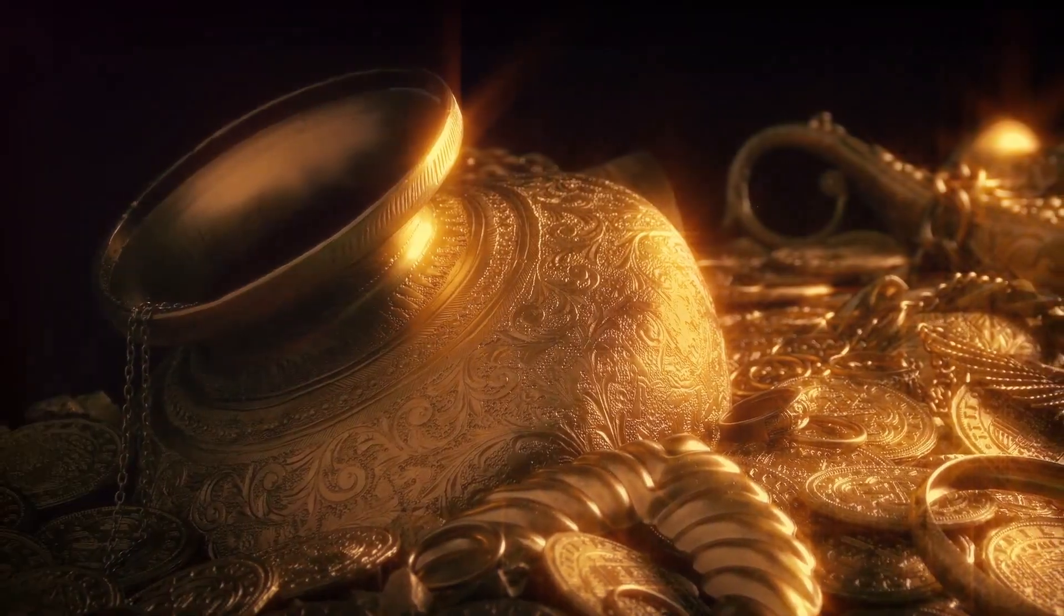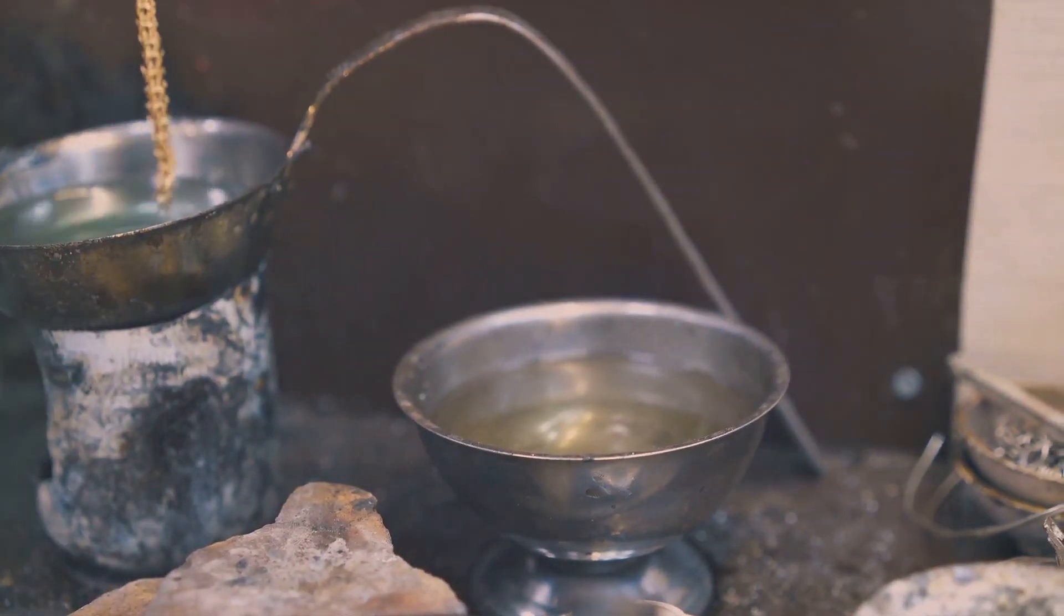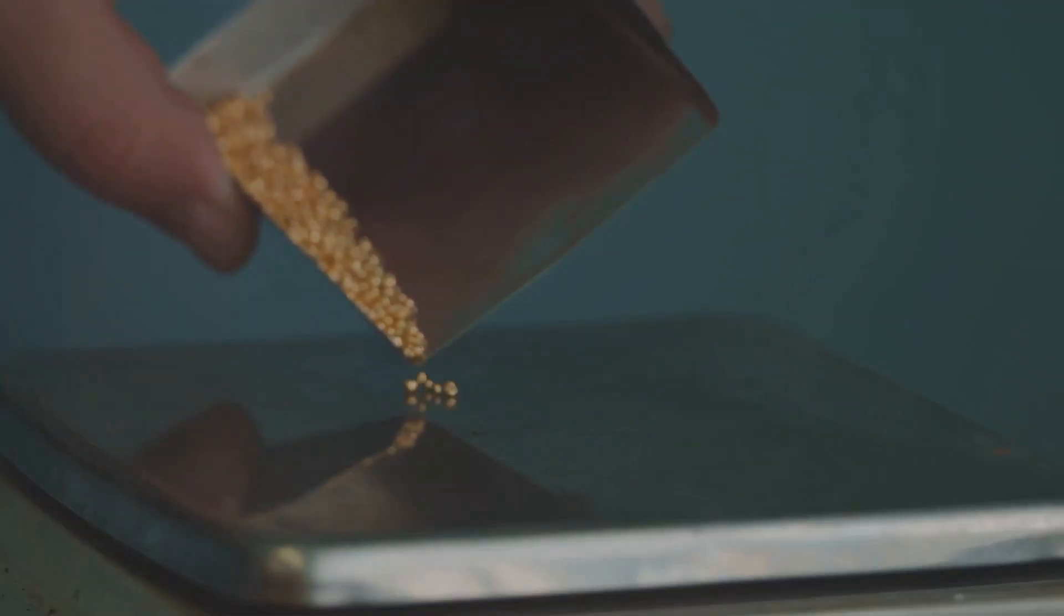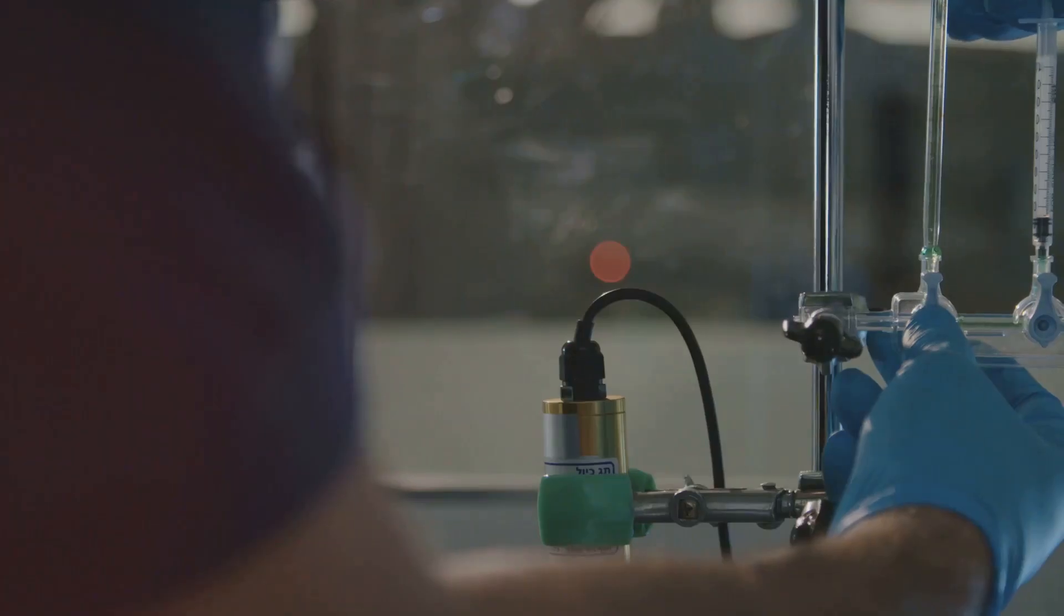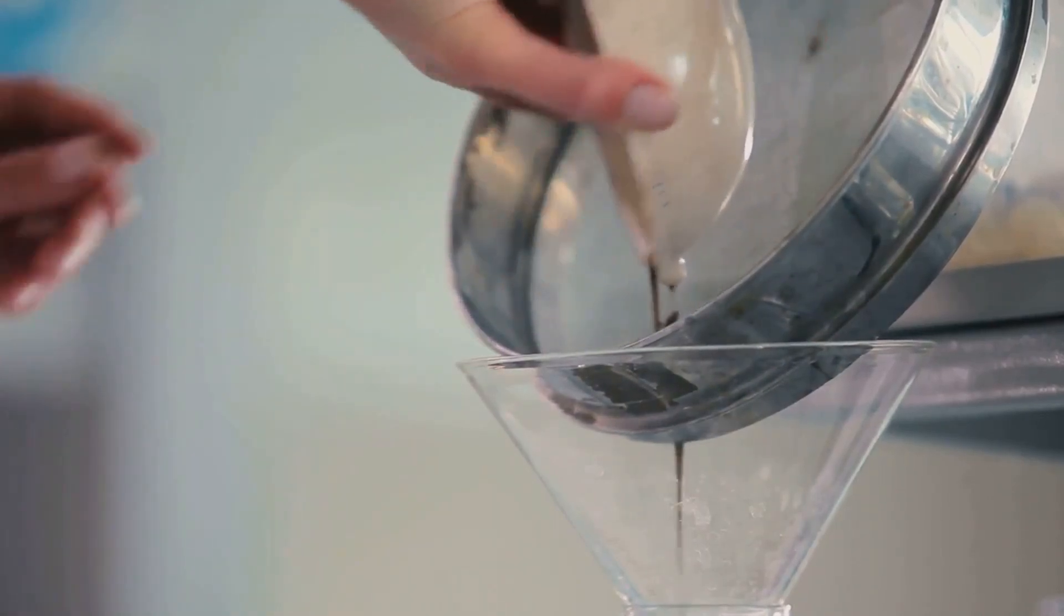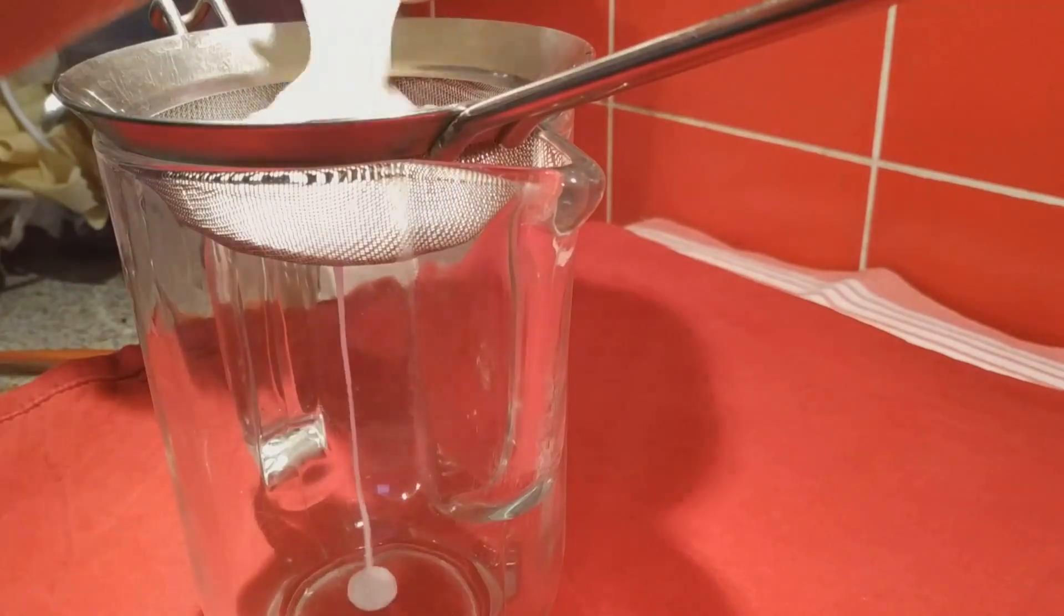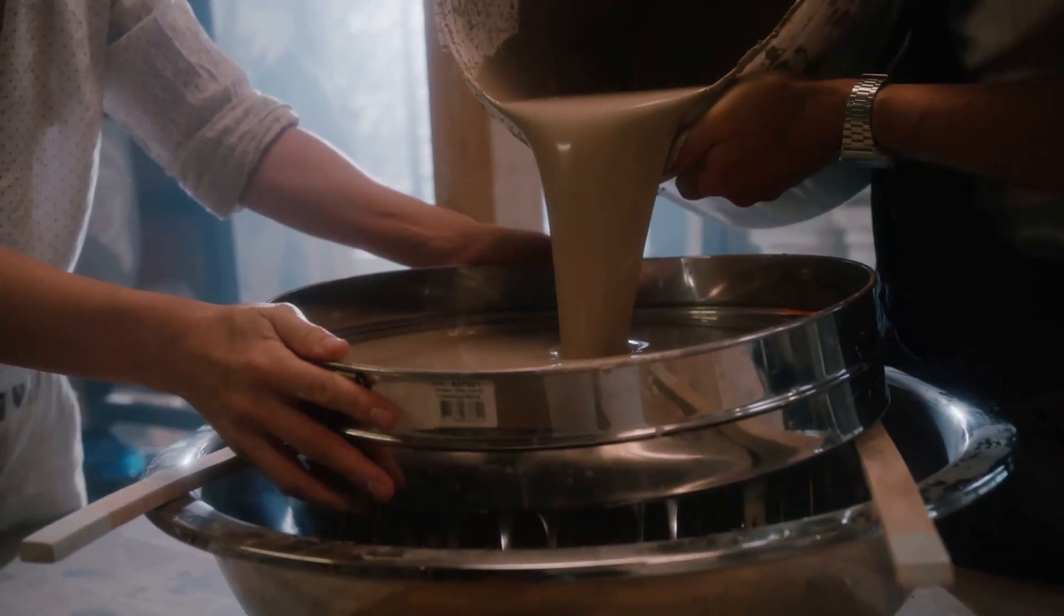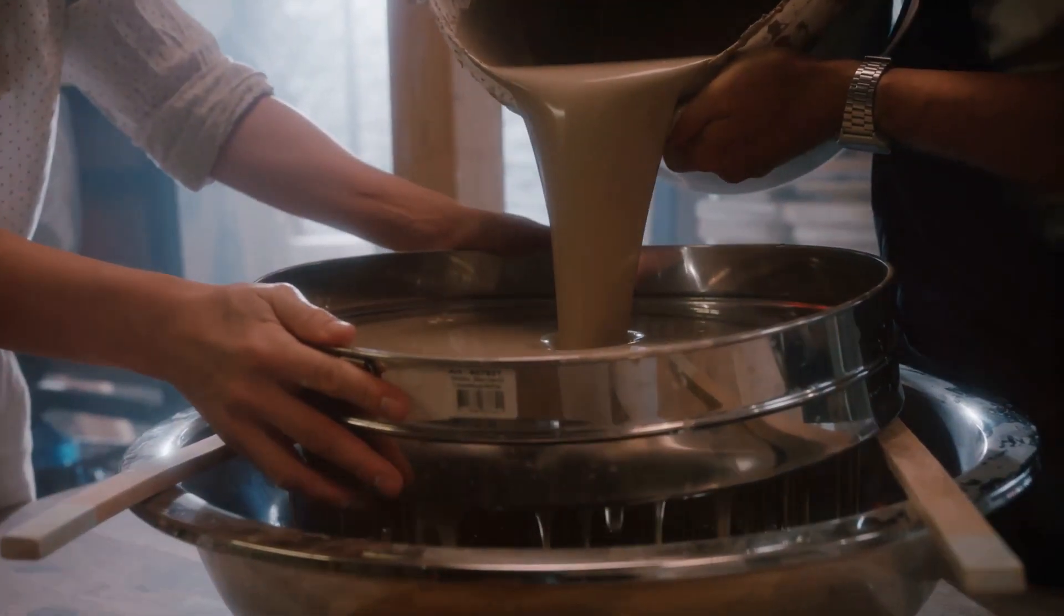Capturing the prize: filtration and collection. We're in the home stretch now. We've successfully separated the gold from the other metals and precipitated it out of solution. Now we need to collect our golden prize. Remember the funnel and filter paper we gathered earlier? This is where they come in. Carefully set up your funnel with the filter paper and place it over a clean beaker. Slowly pour the solution containing the precipitated gold through the filter paper.